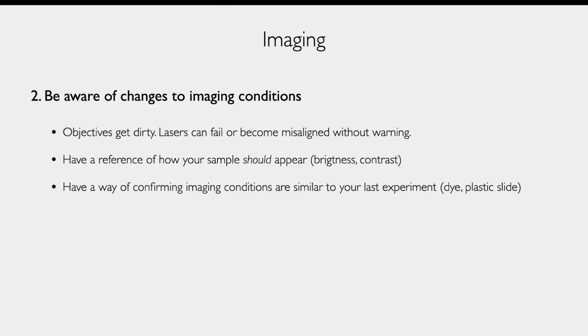So if you really care about the work that you're doing, it's good that when you go to the microscope, you have some idea in mind about what you're expecting to see. Many of you will be imaging samples over multiple days that are very similar to each other. So you can have in mind, okay, how bright is my sample supposedly going to be? Maybe I'm expecting counts of about 10,000 gray levels for the green channel.